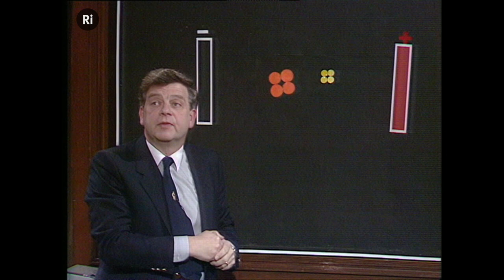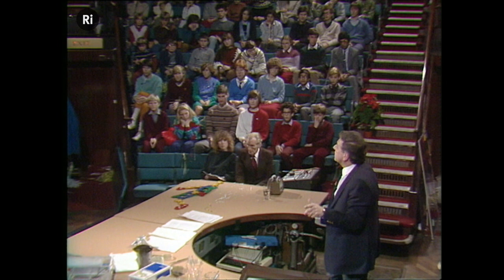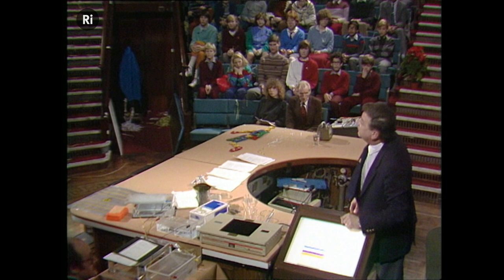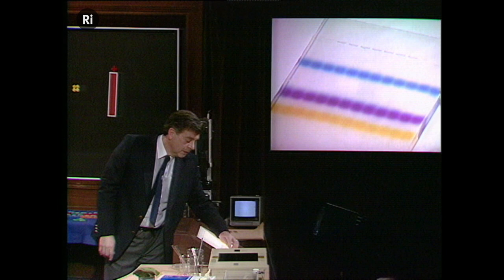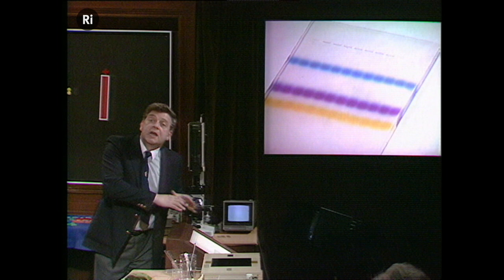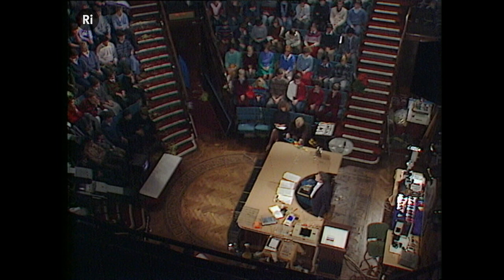Now, we set up an experiment like this a little earlier so that you could see just exactly what happens. And here is the gel on this lectern, and you can see the gelatinous material on the glass slide, and you can see the separation now of three different dyes, the blue, the purple, and the yellow. That's what happened when we've let that electric current run for a period of time to separate out those molecules of different size. And that's the principle on which we separate out the DNA molecules of different size that arise when we cut a DNA molecule up.